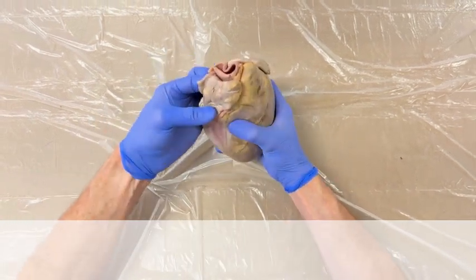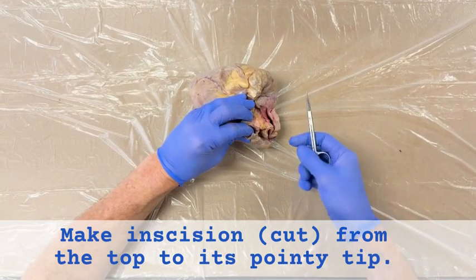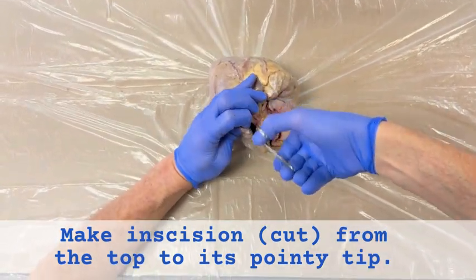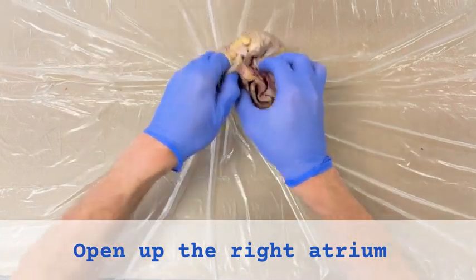I'm going to stick my finger in the ear or in the auricle, and then I'm going to make an incision, or a cut rather, from the top of the auricle to its pointy tip. And I'm going to open up the right atrium.